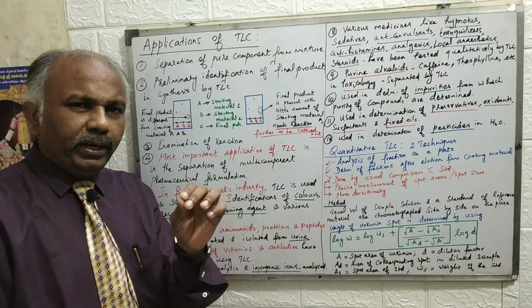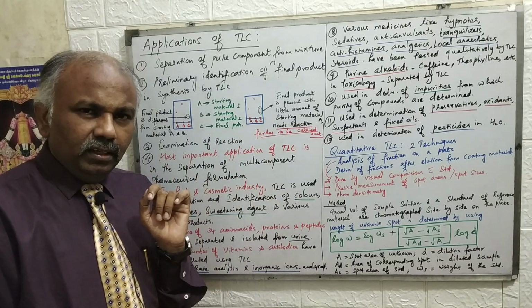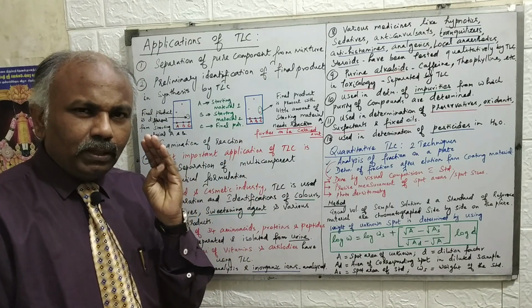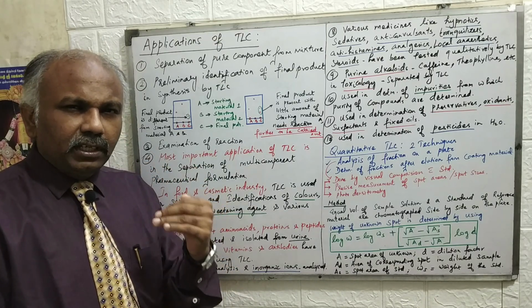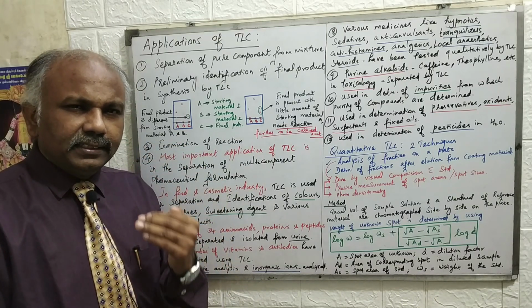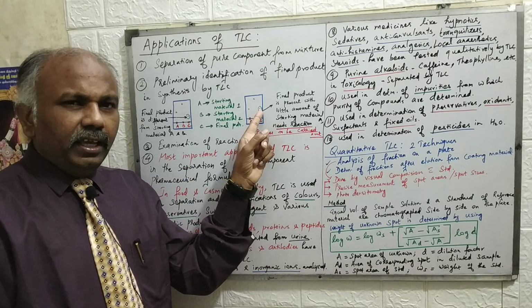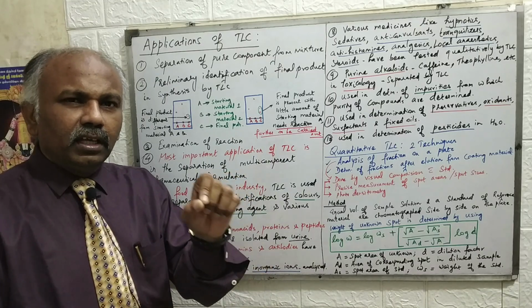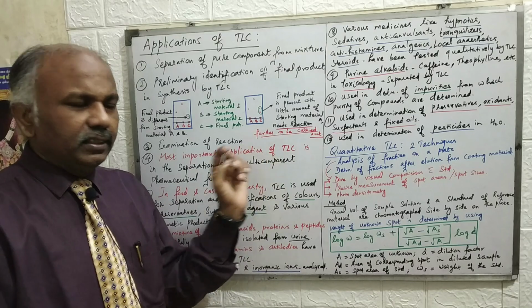That means hardly 5 to 10% of starting material A is present along with the final product. So we have to optimize the chemical synthesis. We have to monitor the temperature, or increase the reaction time so that the rest of starting material A also gets consumed and you get the pure final product, right? So this is how we do it in TLC.